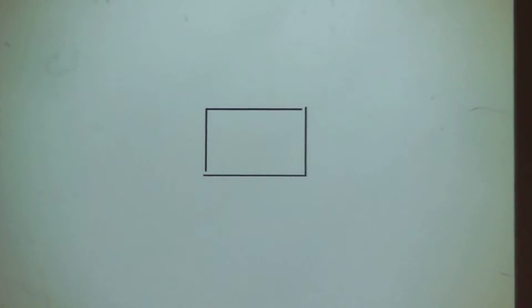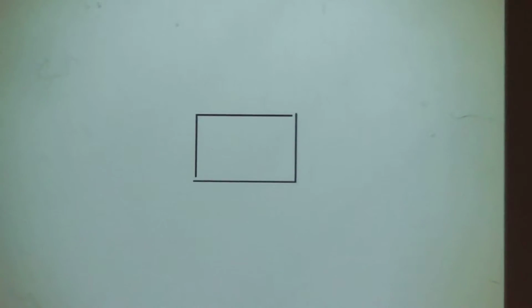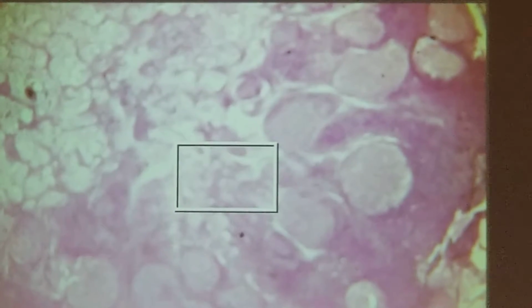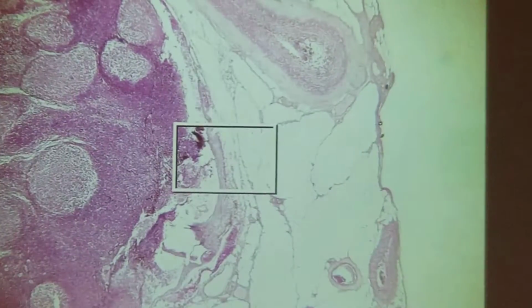Next up. Number 9, reticular connective tissue. Reticular connective tissue, slide number 9. So this is a type of loose connective tissue, so when you first focus this one, you want to see there's all kinds of different stuff. Way out here, what kind of tissue is that out there? Can you tell us, Bubba?